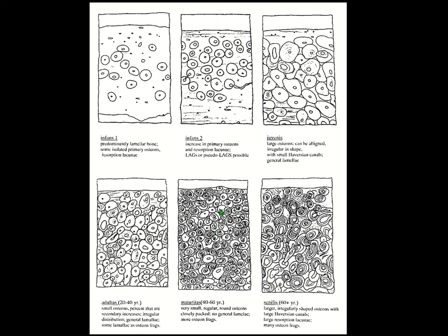And so what you do have is this. So this is an important technique for people who study human osteology to age the populations of skeletons they're looking at. So, yeah, something else you can do with thin sections. In fact, we have actually done this at the ROM.